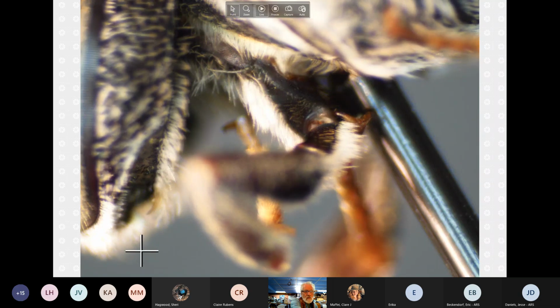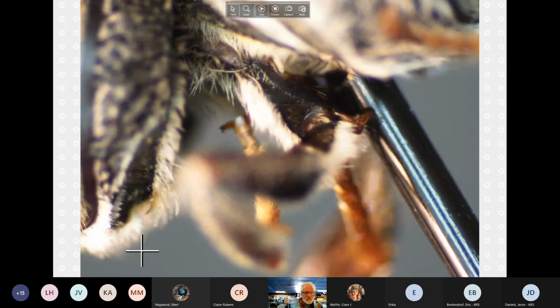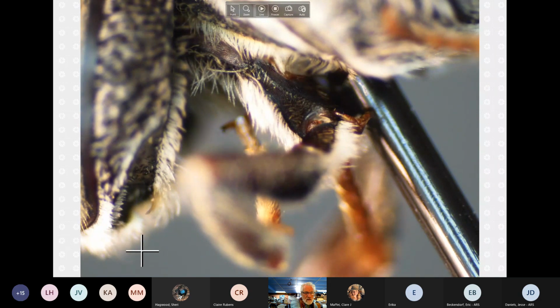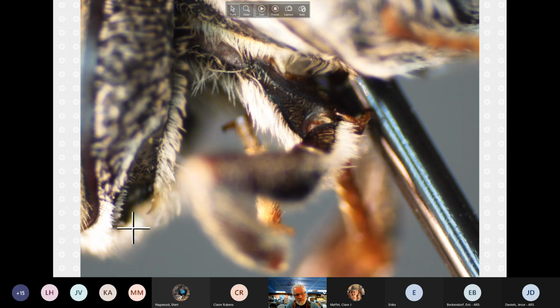And what you're looking for, and as Dave Capper is so much working on, just in general, having a bunch of pictures of all these different characters would be great. So we have things to do. Anyway, I'll have to look. So here's the hollow.